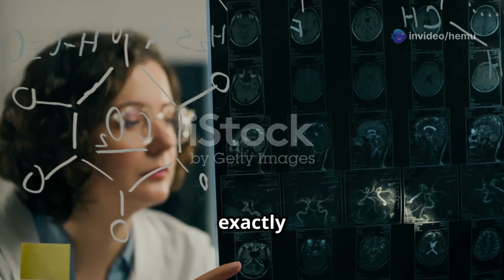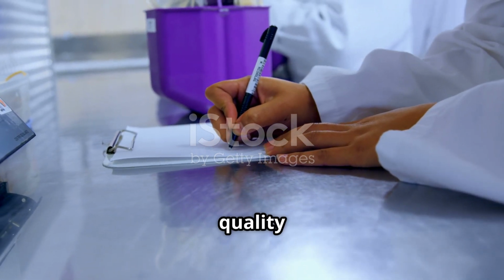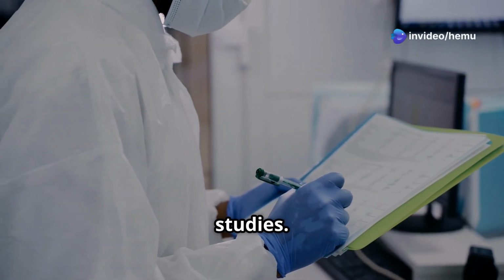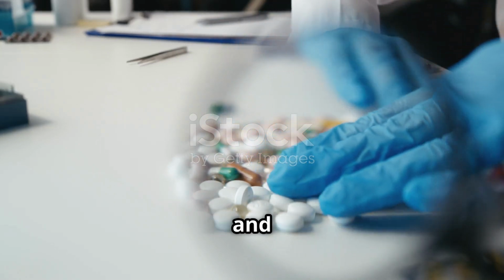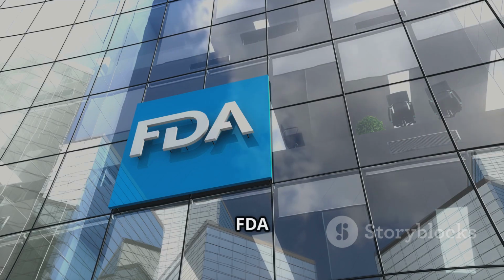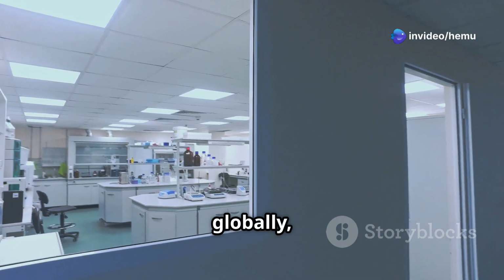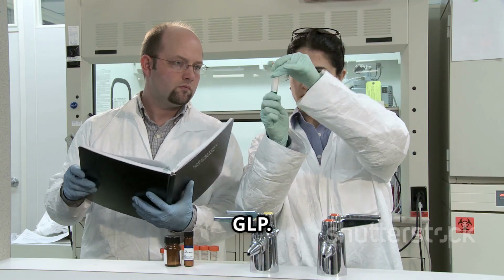So, what exactly is GLP? In a nutshell, GLP is a quality system ensuring the reliability, consistency, and integrity of non-clinical laboratory studies. These practices are vital for supporting the safety, efficacy, and regulatory acceptance of pharmaceutical products. Agencies such as the FDA in the United States, EMA in Europe, MHRA in the UK, and the WHO globally enforce these guidelines. Now let's break down the key principles of GLP.